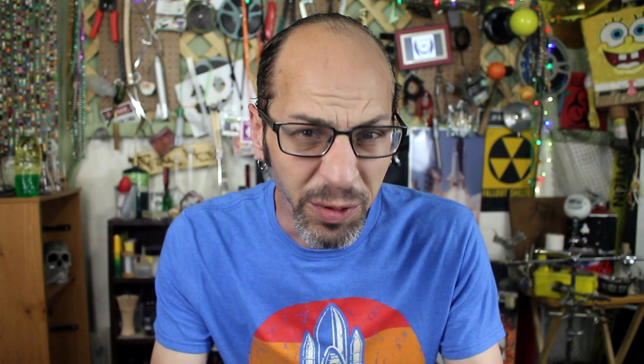All right, so I want to grow some crystals, but we've got to make some awesome crystals that are only fit for a pirate. And to do that, we're going to have to make a couple things first. So today's all about making some sodium oxalate.